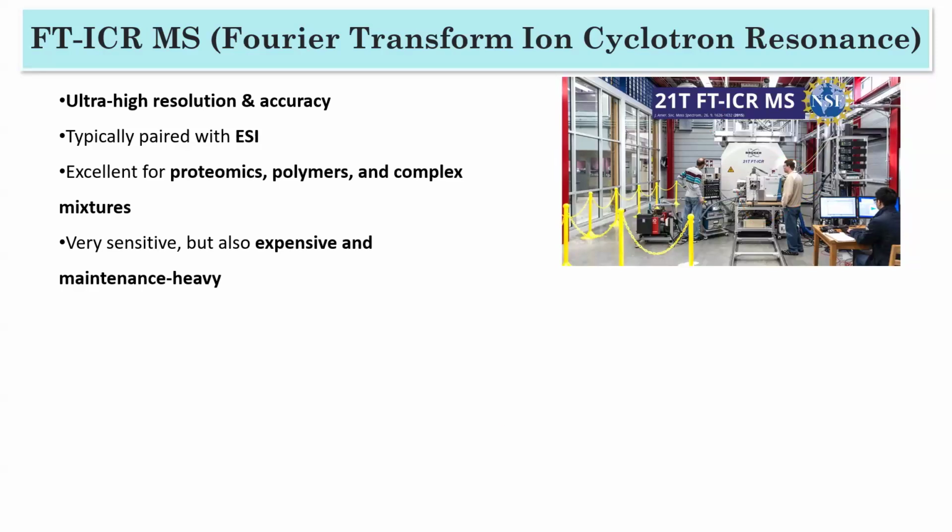Someone is asking what is covered on the third day of this workshop. On the third day we are going to cover fragmentation. There are a lot of things, and I will also show different examples of fragmentation, analyze the spectra and then talk about them. But we are not going to cover the theory part. Sorry, we are not going to cover the data analysis part, like using some software.